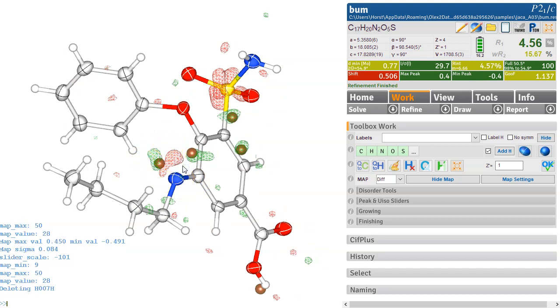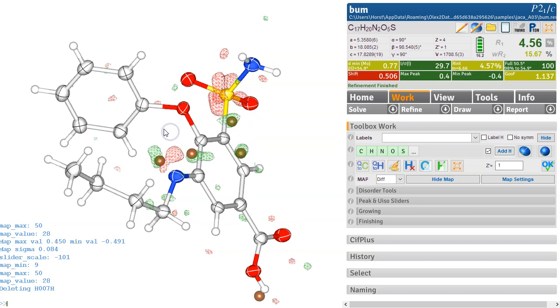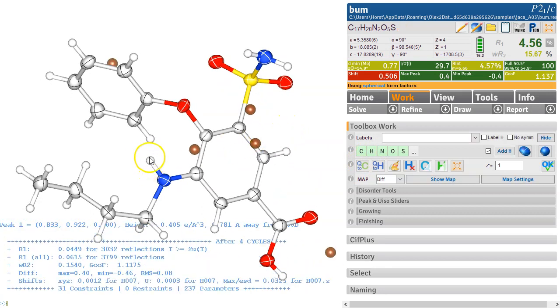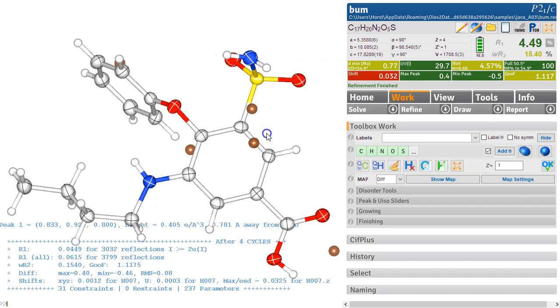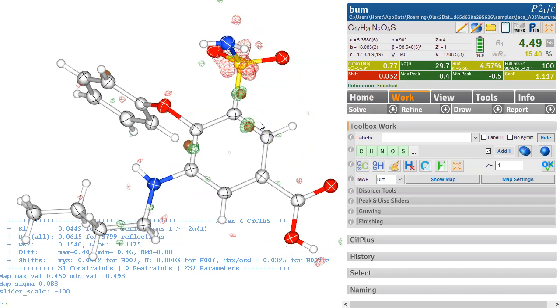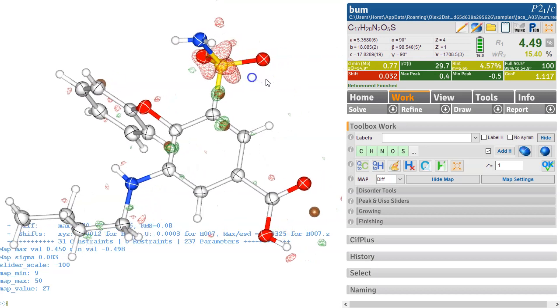And I suggest what we do here is to just refine it completely freely. So I just select this and make it a hydrogen just by clicking on it. So that makes it a hydrogen and just see whether it refines freely. Of course, that takes more parameters because X, Y, Z need to be refined independently. So the data to parameter ratio, but it's quite full. So we've got a lot of data here. So the parameters don't run out. So Control M now gives us a very clean structure.